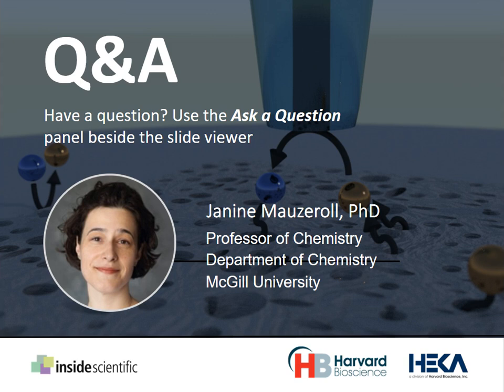Okay, so thank you very much for the question. In our group, we've developed some magnesium ion selective electrodes.